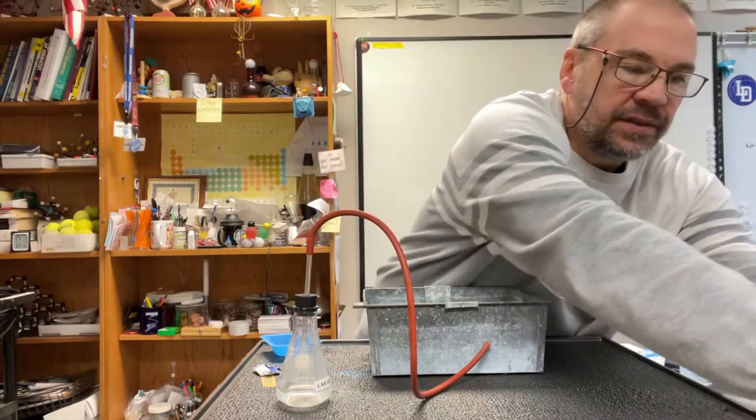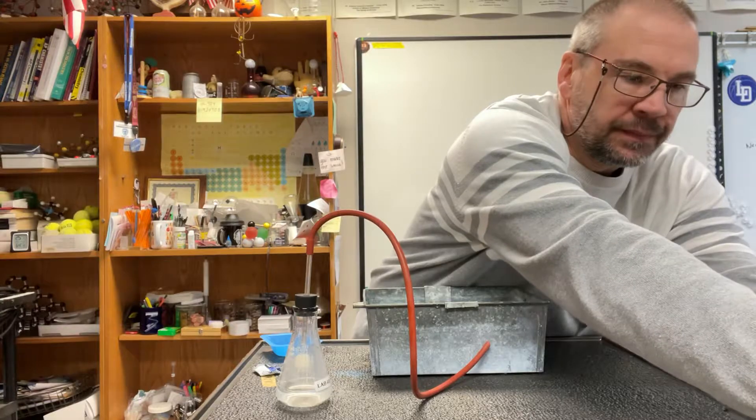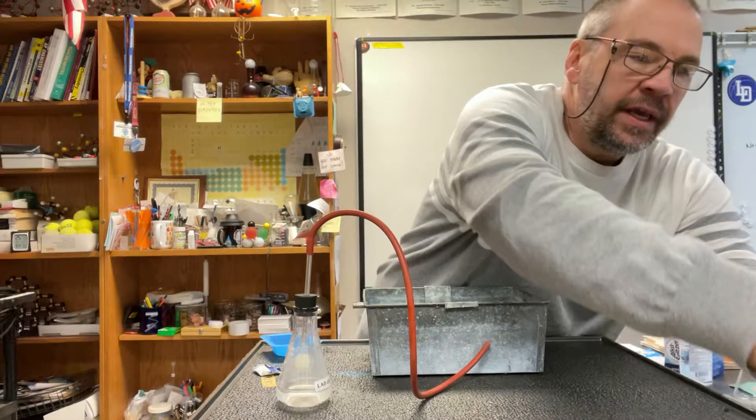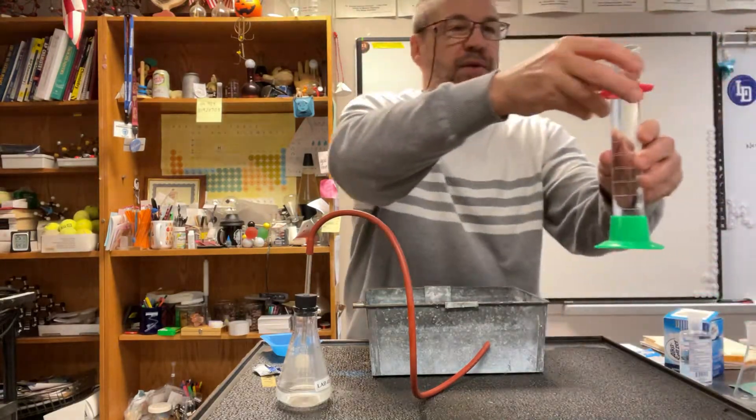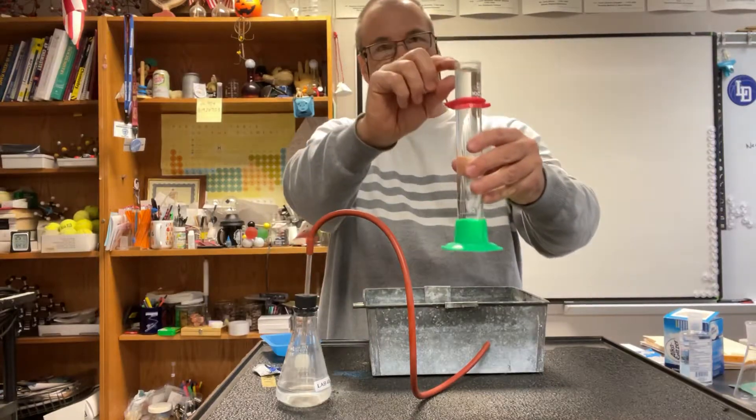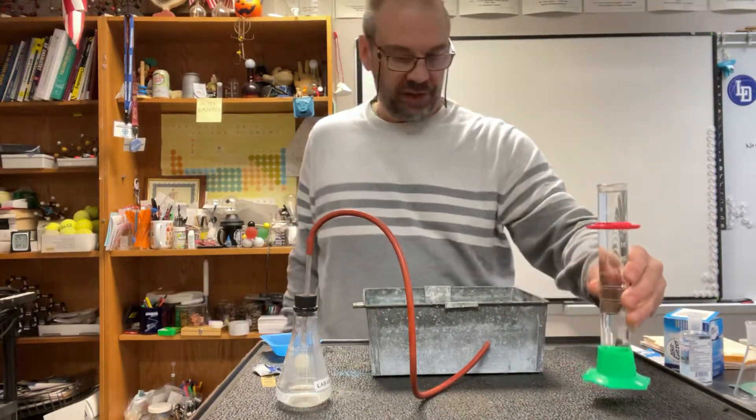The way we're going to do that is we're going to fill up our graduated cylinder with water, and you want to get it not quite to the top. You want to leave a little space there, probably about a quarter inch or so, maybe a half inch.